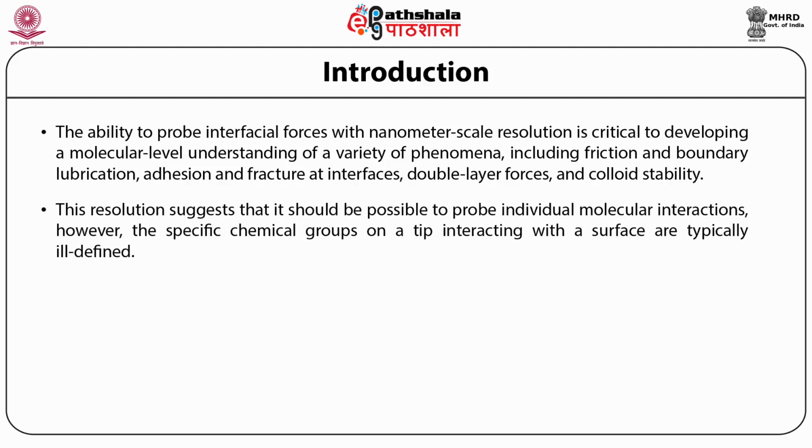However, the specific chemical groups on a tip interacting with the surface are typically ill-defined. In addition, the contact area of the tip on a surface can be quite large because of the finite tip curvature and tip deformation resulting from surface forces.